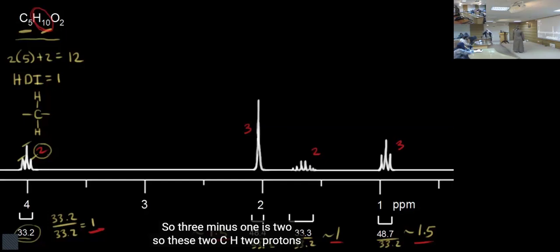These are all relative to what you consider as 1 proton. You have to assign either 1 proton or 2 protons first. Then the computer automatically integrates the others. So that is all related. Just write it down. Okay.